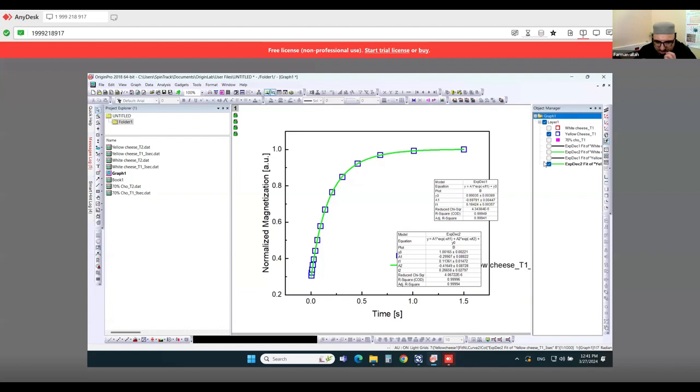Okay, so here you see that the biexponential is better than mono up to some extent. You see it's like this, and when you see it, it is in the center. So you will decide in this way, as I told you before, what things you keep in mind to select this. And similarly we will go to other parameters.